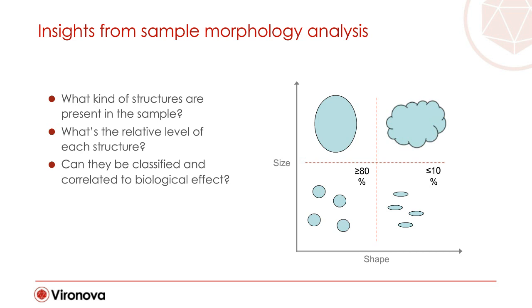So there are a lot of parameters that can influence the quality of the product and which can be monitored using electron microscopy and image analysis. Therefore, I would like to give the word to you, Martin, to tell us more about the MiniTEM system and how it can be helpful with all the automation that has been built into the system.